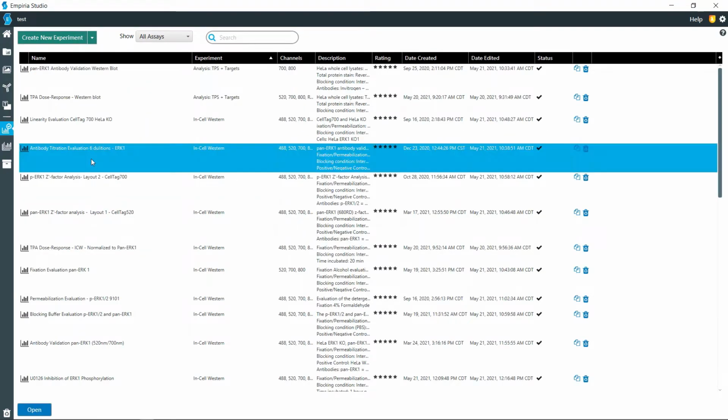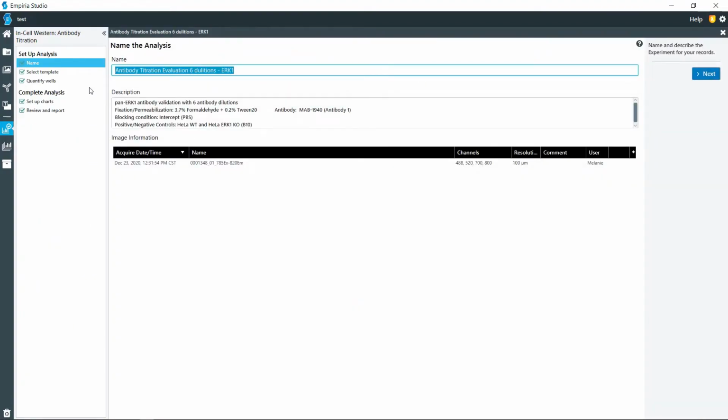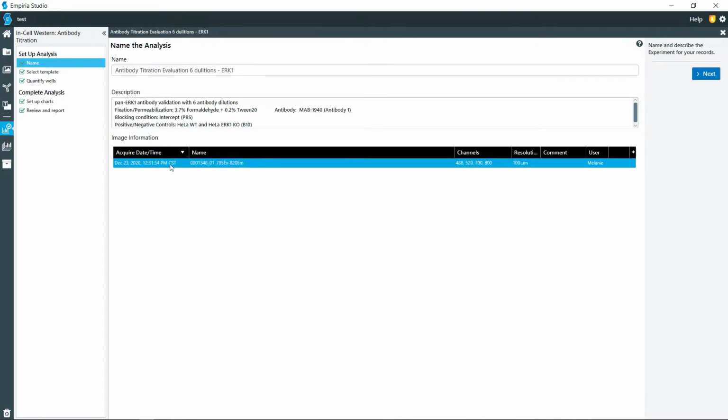Just like all the other videos, you need to first name the analysis and then bring in the images that you want to be analyzed. So here we have this one that is already named. We have the images that were done for this experiment.